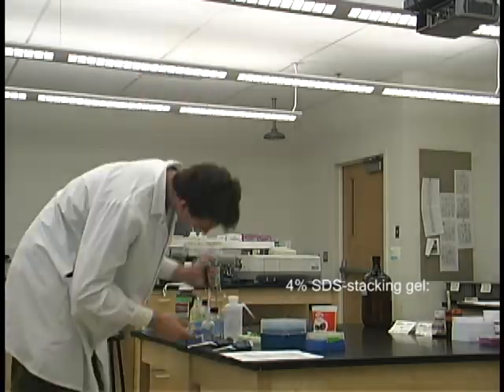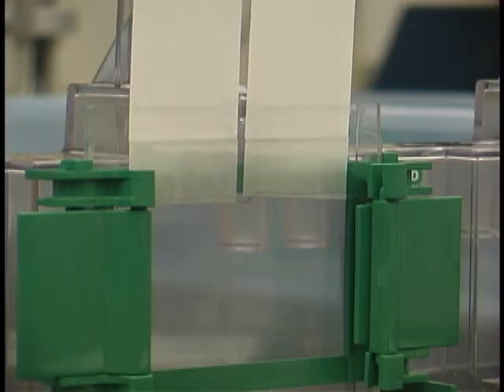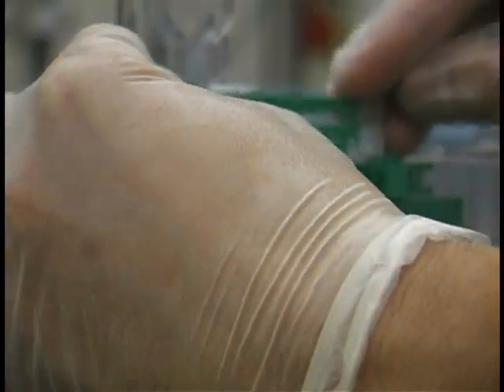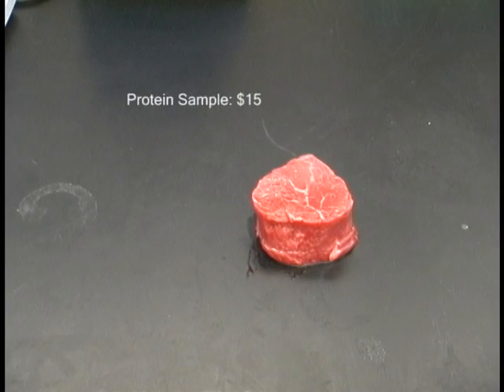4% SDS Stacking Gel: $4. Protein Sample: $15.